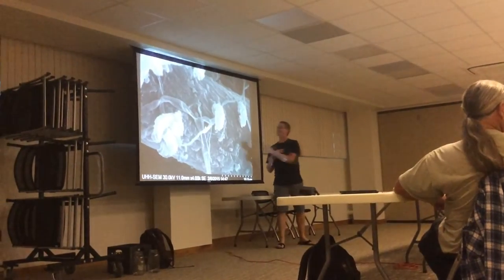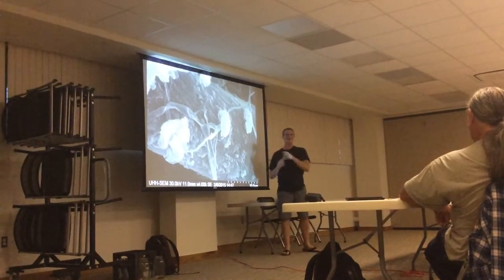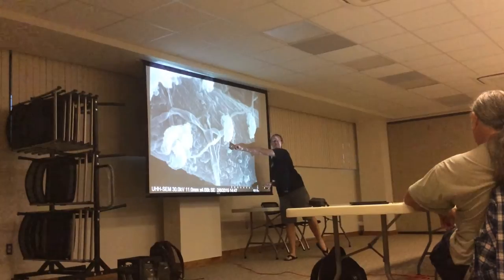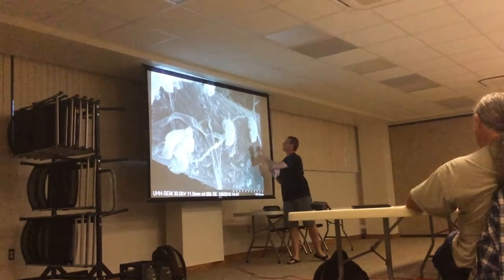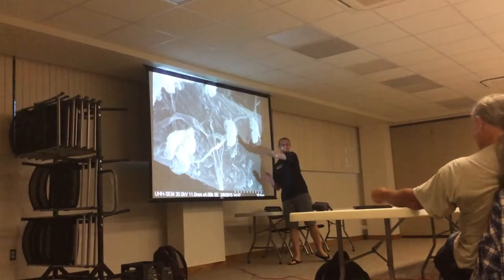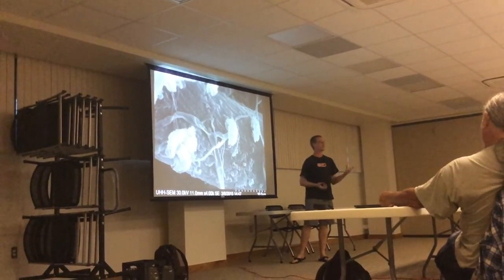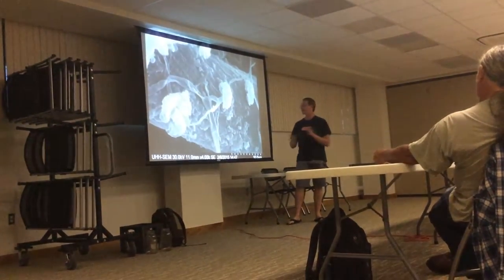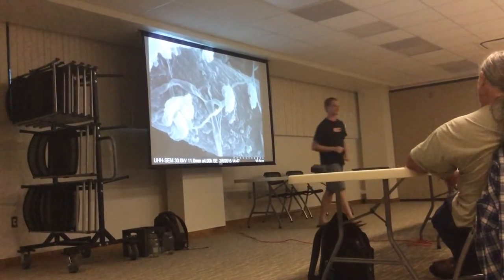And I don't want to get that parent material confused with this guy, which looks an awful lot like a clump of the parent material. Which is actually a bacteria - it's one of the forms of bacteria that we're going to see. But it looks scaly and layered just like that parent material. So with the educated eye, we can find them and pick them out. Of course, we have our bacteria and fungi and hyphae, and we'll look at that in a second.